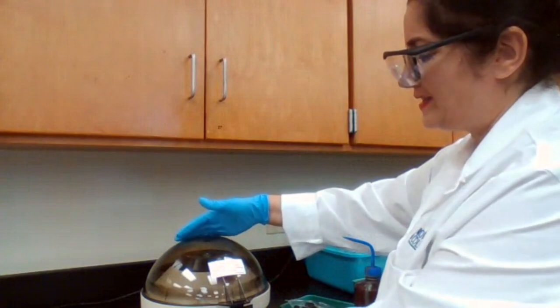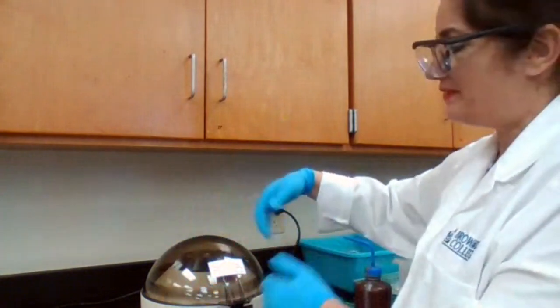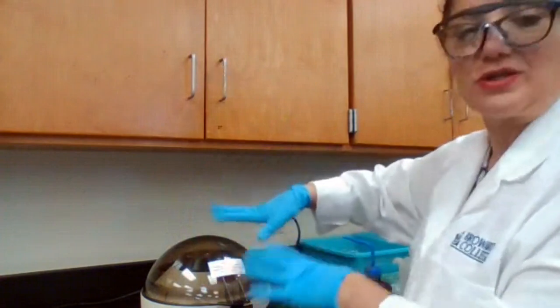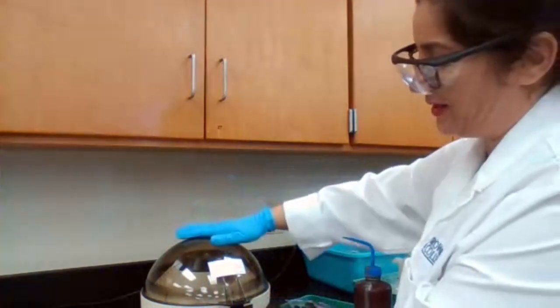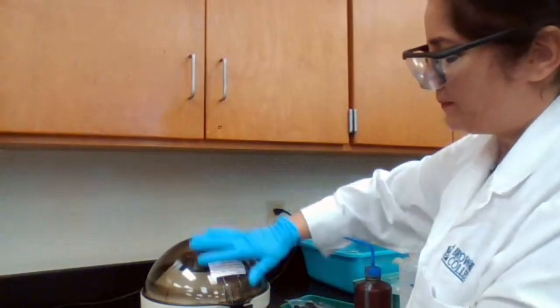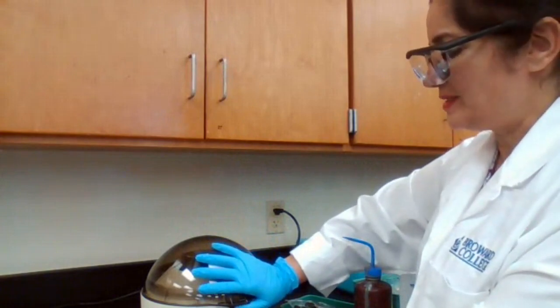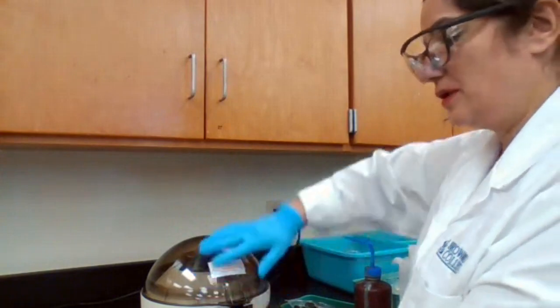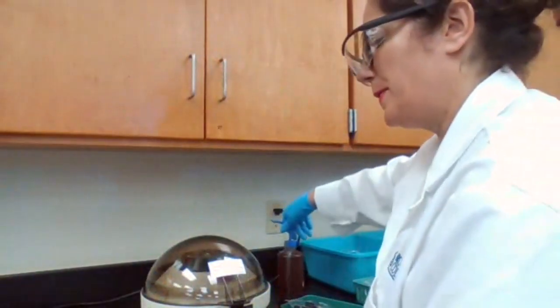If the centrifuge is not balanced, it's going to start moving around. If it is balanced, it will stay still. So it's going to talk to me and say, I'm not balanced. Or if it's balanced, it's going to behave. So I turn it off after 30 seconds, and I take the test tubes out, and follow the second step of the experiment.